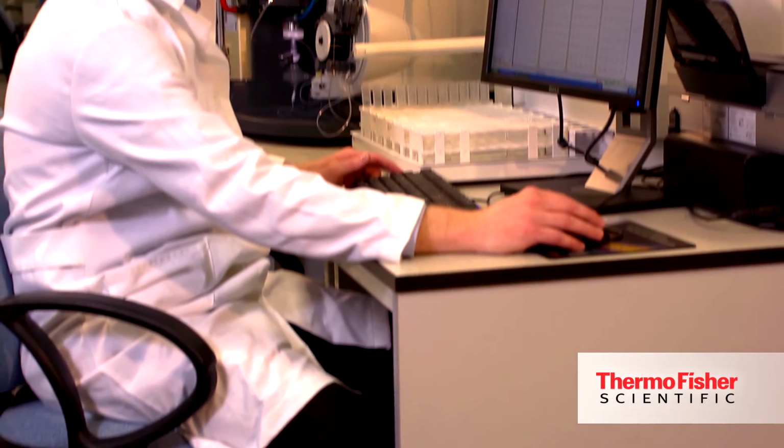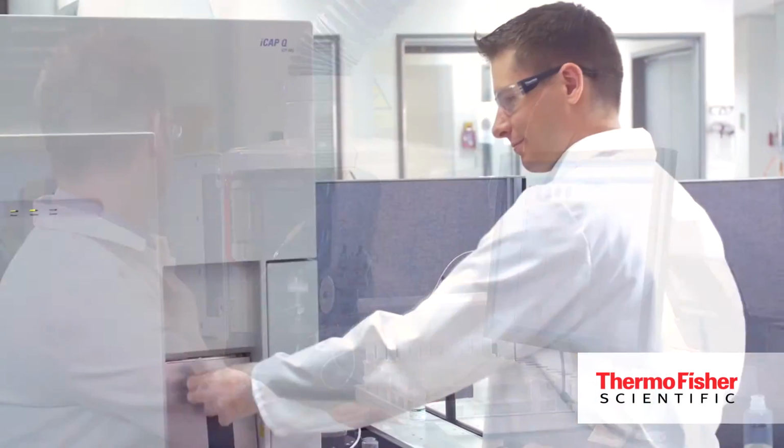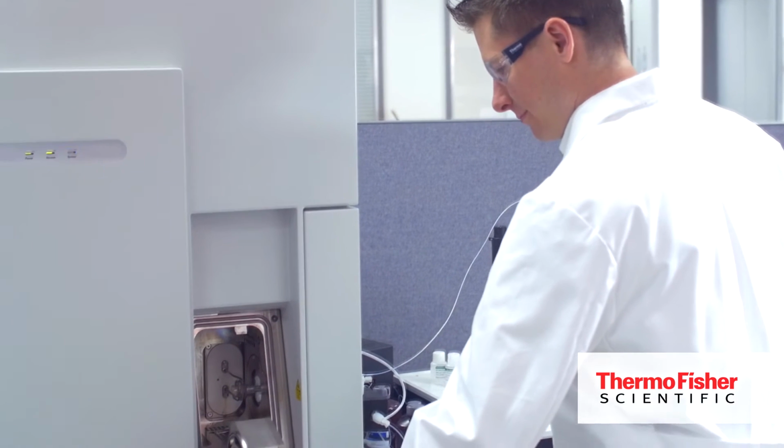Of course, alternative procedures or methodologies can also be used to analyze elemental impurities, and Chapter 233 also explicitly states the validation criteria for these alternative methods. In principle, the two techniques I mentioned, ICP-OES and ICP-MS, are both well capable of doing the job. Both have enough detection sensitivity and dynamic range, but especially with drug products with a very high daily dose, the amount that you have to detect in your sample becomes smaller and smaller. Therefore, with ICP-OES, you might come to a certain threshold limit where the limits of detection that you can achieve with the instrument are very close to what you need to achieve.